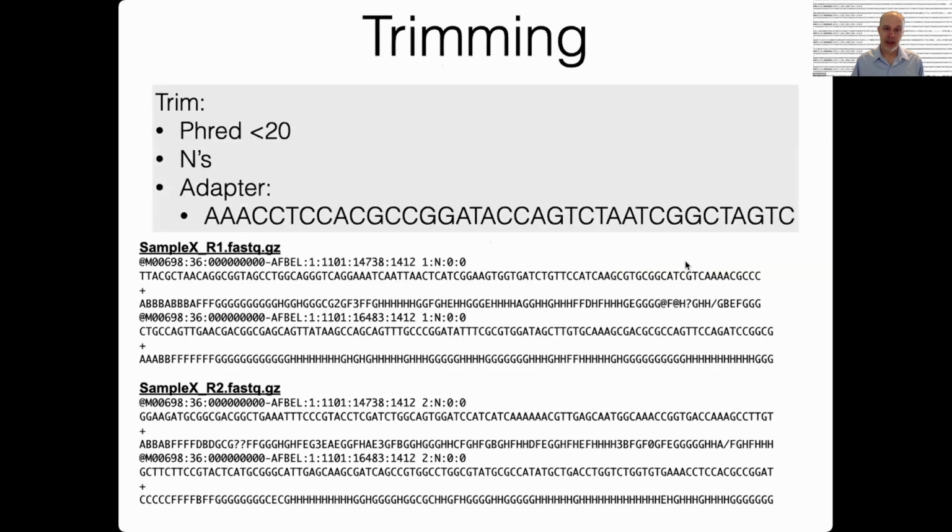And the other thing is that, like I told you, the quality scores are an estimation of the software. And so even though you might have, like here, a 2, which is relatively low, and then you have a G that is relatively high, this G might overestimate the quality. So it's a good point.